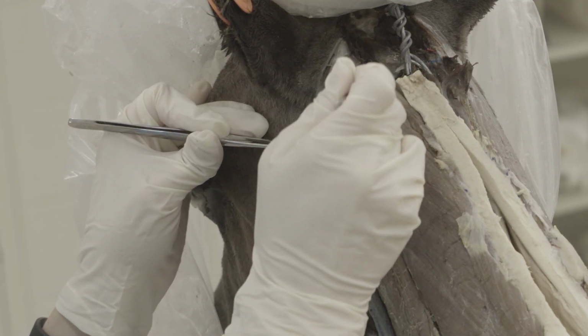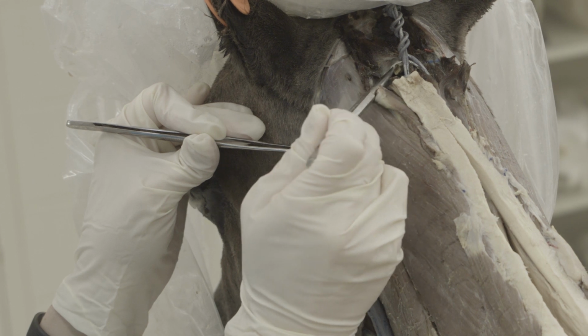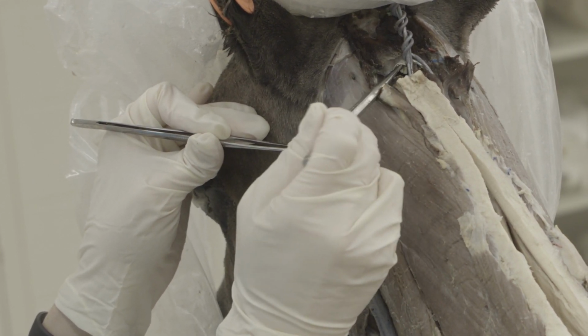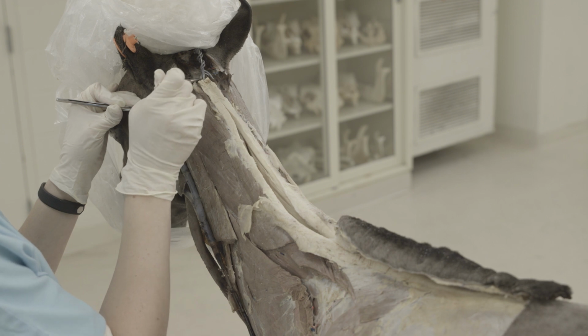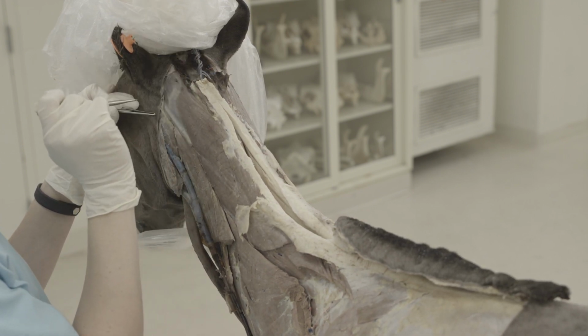Then you have the atlanto-occipital membrane, which may be difficult to see, but you can see part of it here being elevated by the probe. It's just that tissue, that fascia, that's very thick and covers that space. So that's the atlanto-occipital membrane. So that's what the wire passed through to get around the atlas.